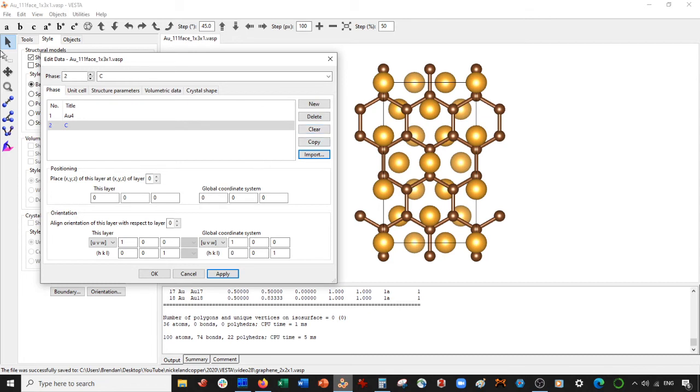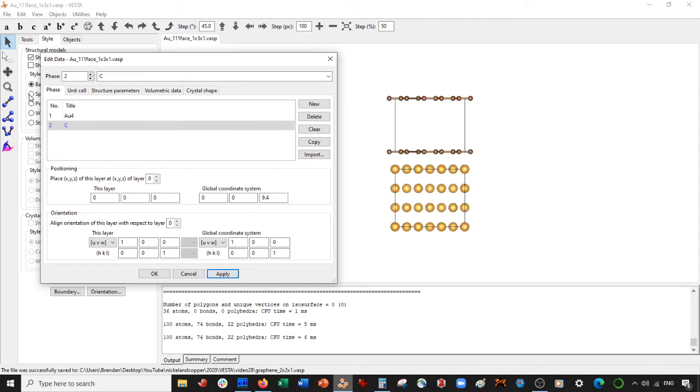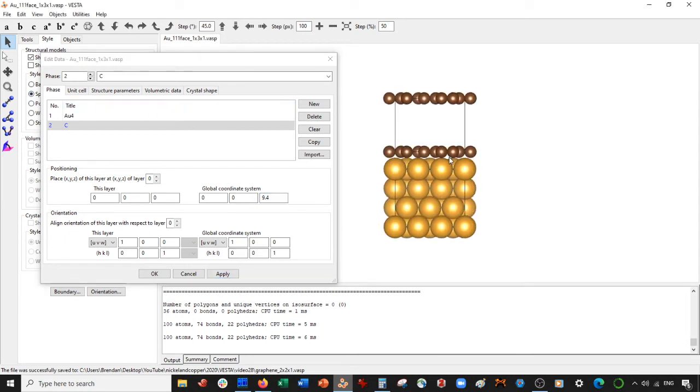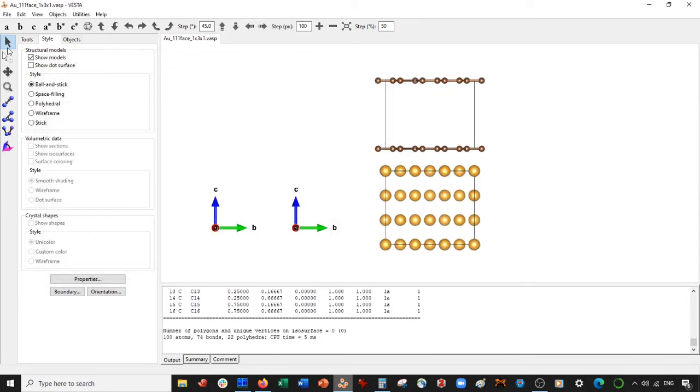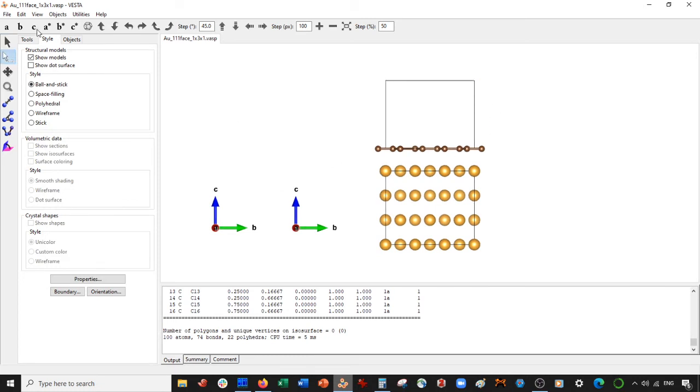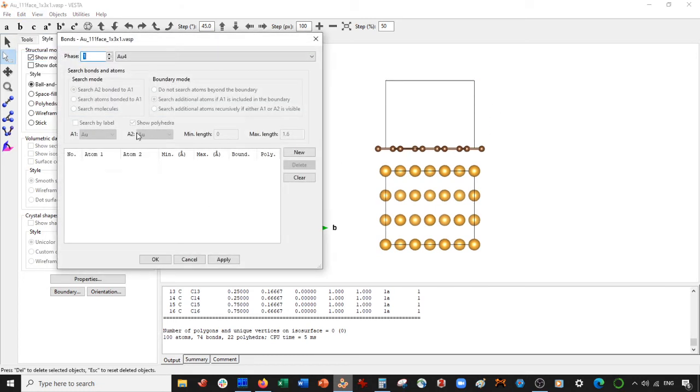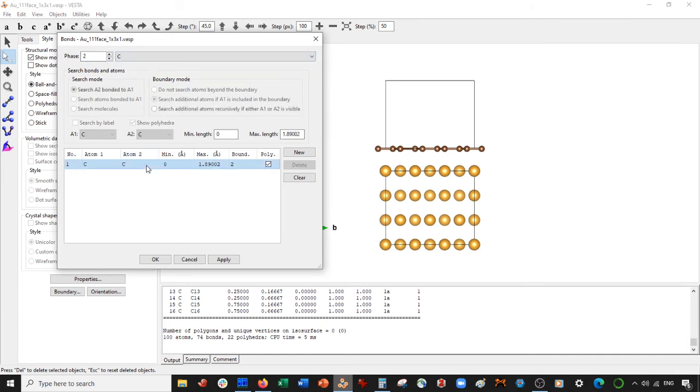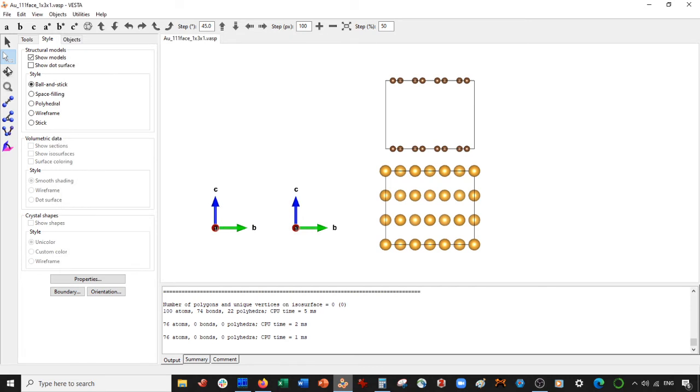Okay, so now what I'm going to do, I'm going to move up the graphene 9.4. I found this to be a good distance because when I go to space filling, you can see they're right on top of each other. Now select OK. Now what we're going to do is we're just going to make the monolayers now. So actually, what I'm going to do first is go to bonds, go to the carbon phase for the graphene and delete the bonds. Select apply.